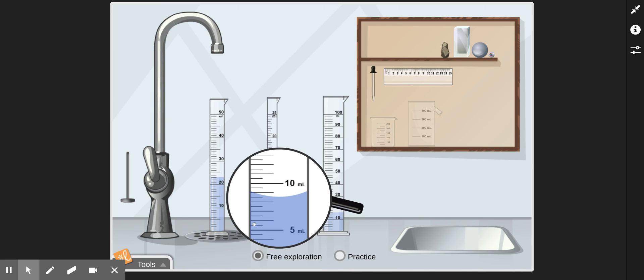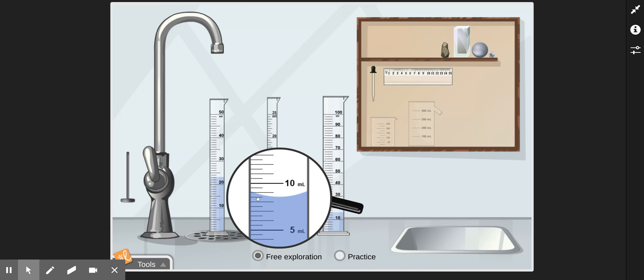And let's double check that. 5, 5 and a half, 6, 6 and a half, 7, 7 and a half, 8, 8 and a half, 9, 9 and a half, 10. So that checks out. So knowing each line is 0.5 milliliters, and we measure from the bottom of the meniscus, which is in line with this, we go 5 and a half, 6, 6 and a half, 7, 7 and a half, 8, 8 and a half milliliters. So the second cylinder has 8 and a half milliliters.